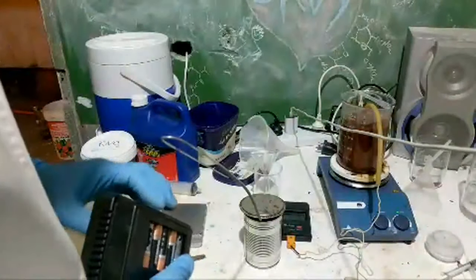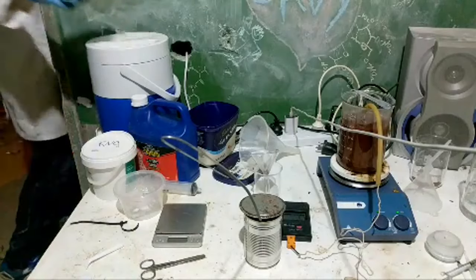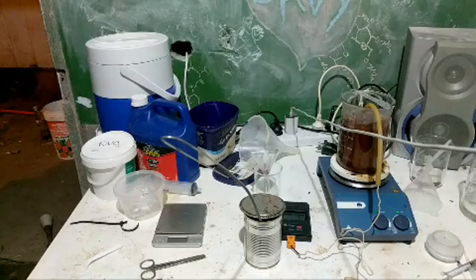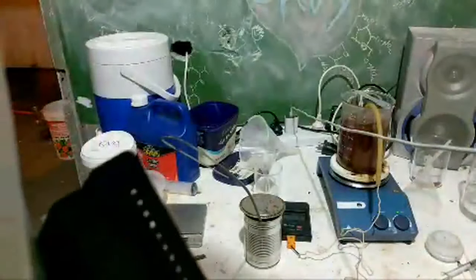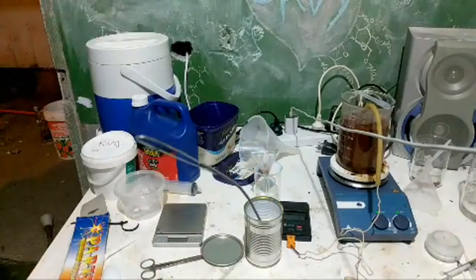Don't think a fuse will work. You don't think it'll be hot enough? Okay, let's see if I got more sparklers, because if it doesn't light, we can just try a different method. Heaps of sparklers. The battery's dying on my light. Add sugar might be onto something. Really quick and dirty prep. Let's add a tiny bit of sugar just to help it along.